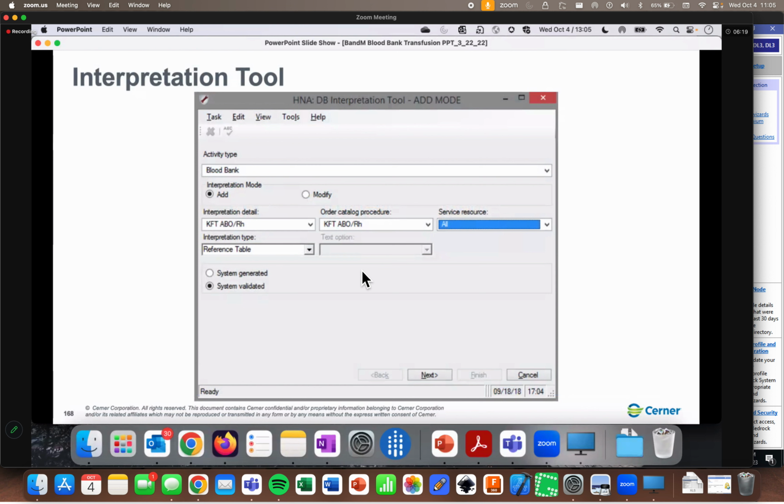And a lot of people say, yeah, sure, that'd be great. But then, they might get pulled away to do another project. They might have the tool bomb out on them. And then they go back into the tool and I guess conveniently forget that they told it to save their build and think that they need to start over. No, you don't. You need to continue the build that was already started. So anytime you see that save box, yes, you are writing records to the database.